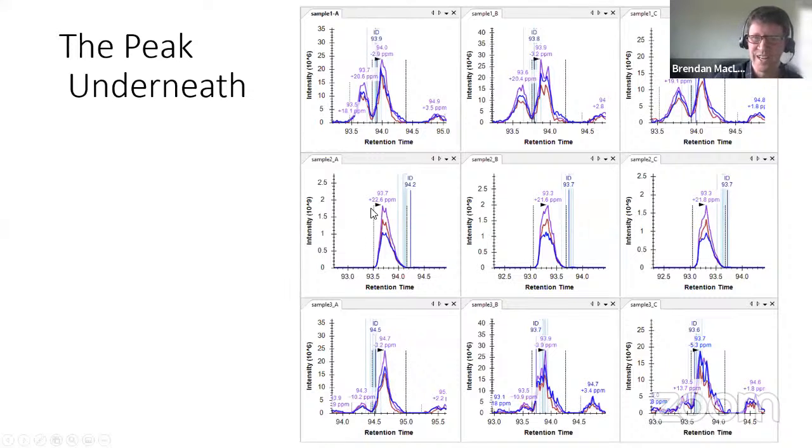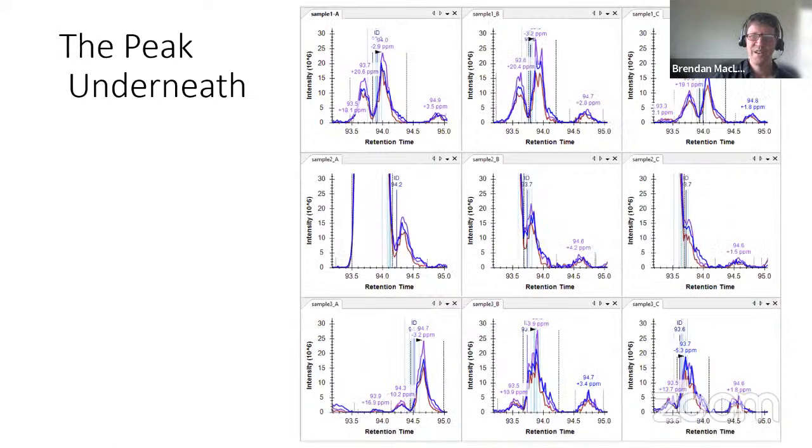So we're maybe starting to see, even at this magnification, wait a second, there's some evidence that we actually are picking the thing to the left here. And with Skyline, it's fairly easy to just put the cursor to the left and zoom in, and then we can see, oh, wait, that other thing is there. It's just getting swamped by this.